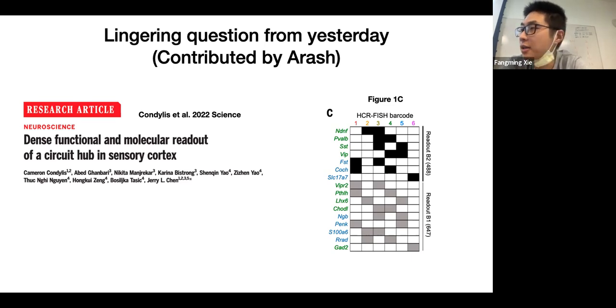So how does this compare with MERFISH? That's the question. I guess you can immediately appreciate that there are fewer genes here. MERFISH can do more than 100 and in some cases more than 1,000. Here are just 16 genes. That's one difference. The other is MERFISH uses Hamming distance. Both use binary code, but here it's a 6-bit code. MERFISH is longer, and you can also focus on the difference between any two genes here. Some genes share the same bit, but most likely every 2 genes you look at here differ by 2 bits. So you could call it a Hamming distance 2 barcoding system, versus MERFISH, which is like Hamming distance 4.